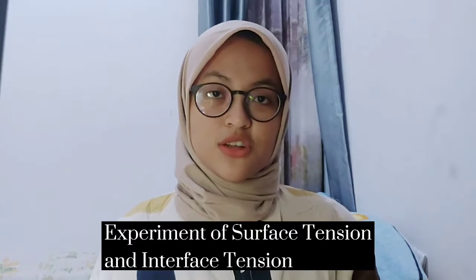206-13038. Today I will show you an experiment of surface tension and interface tension. Please keep watching.